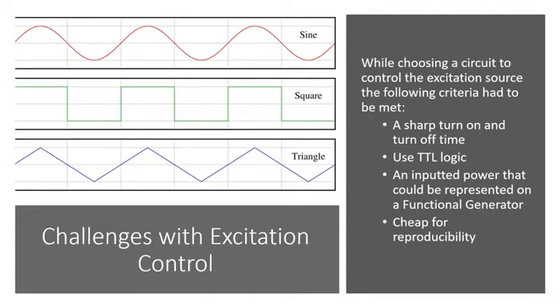So let's talk about challenges faced with excitation control. So we were given a sharp turn on and turn off time requirement due to the nature of trying to capture such fast fluorescent lifetimes. We also had to use TTL logic to drive the signal.